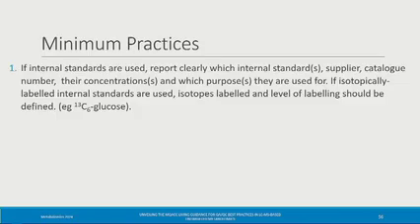So if this workflow would be discussed and introduced, this would be quite a good thing, I think. Okay, good point, yeah, that we didn't show as one of the example uses, but you're completely right, for the lock mass, for mass calibration, perfect.